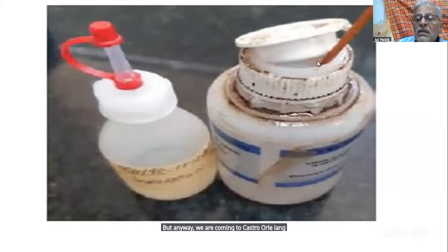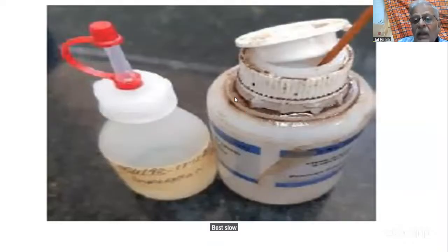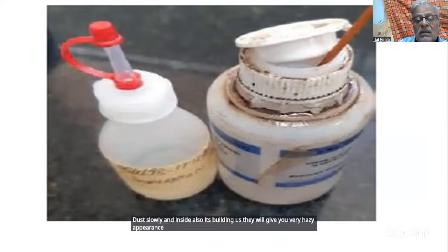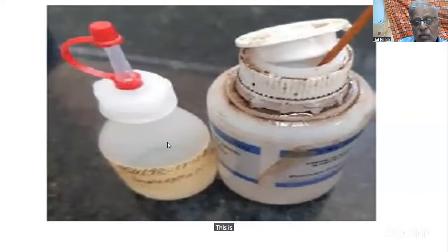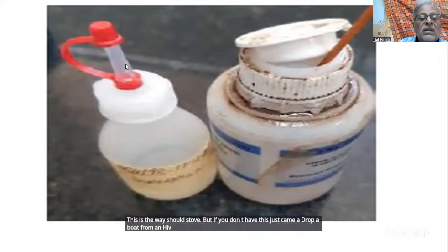Oil like this is dangerous. You have left it open, it's building dust slowly, and inside also it's building dust. It will give you a very hazy appearance. This is the way you should store it. But if you don't have this, just clean a dropper bottle from an HIV kit, thoroughly rinse it with distilled water and add oil in it.